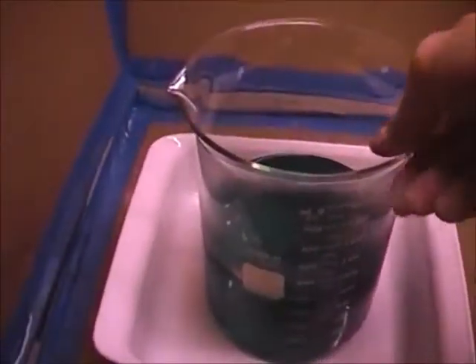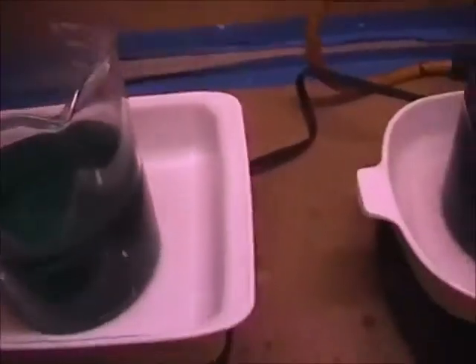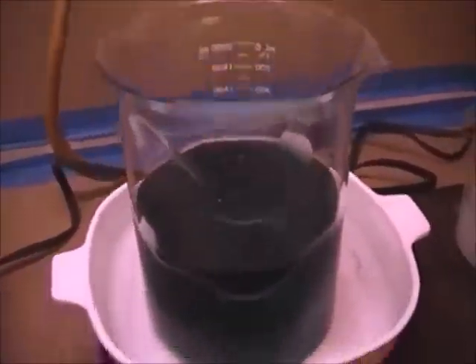And I'm going to turn these beakers to get these numbers out of your way so you can see what's actually going to happen in here when we start precipitating. That way you'll be able to get a pretty good side shot view. And if you look, that's pretty clear in there. You can see the stir stick moving around. The same over here. You can see the pyrex dish through the back of it. And you can see the numbers.